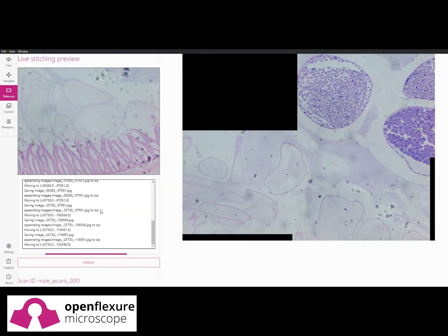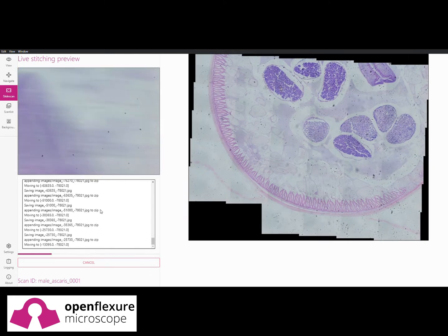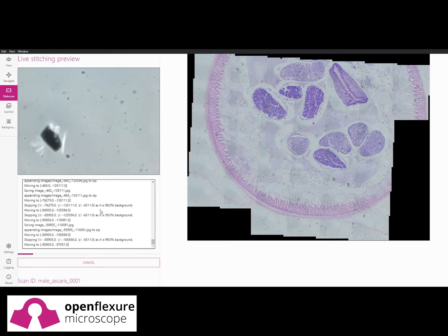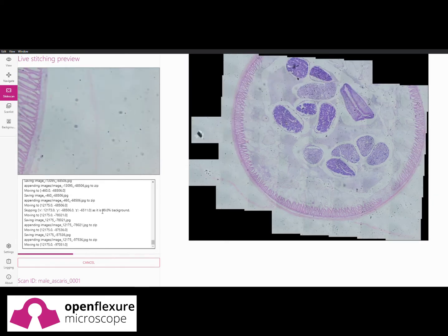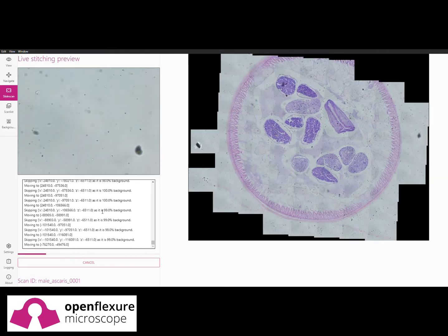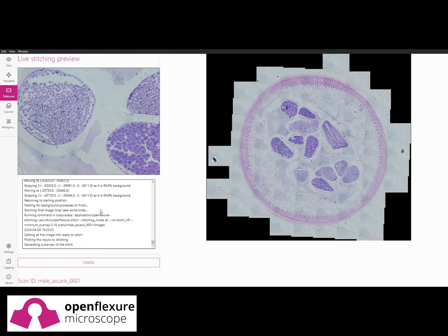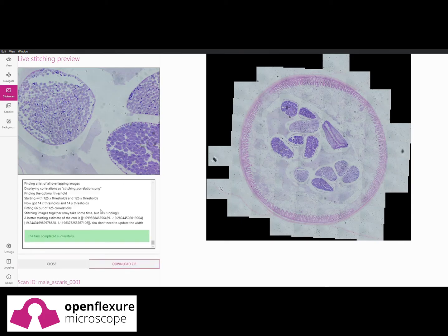The stage is fully automated, intelligently planning its own path around samples. It can also self-calibrate, warning the user if there's any damage that could impact the diagnosis. The automated stage allows huge data sets to be collected and stored. In pathology, this lets samples be archived, shared, or used for the training of medical students.